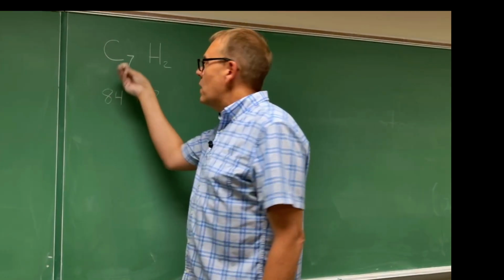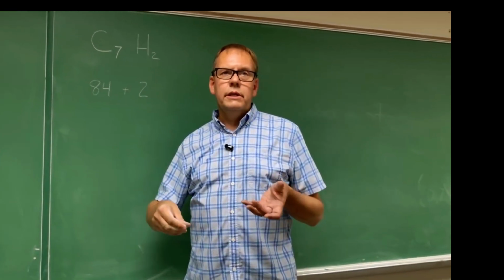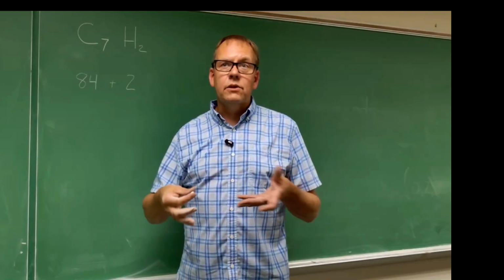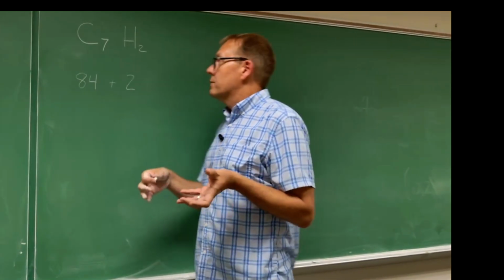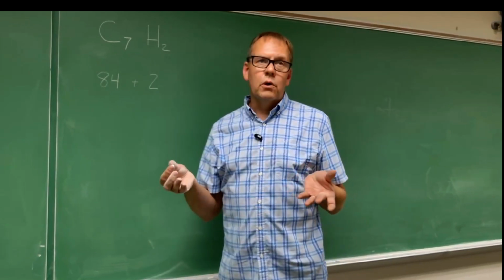That, you can draw the formula up there, but that's not really going to be possible to get a good Lewis structure out of that molecule. There's simply no way to connect 7 carbons and only have 2 hydrogens. It just isn't going to work.